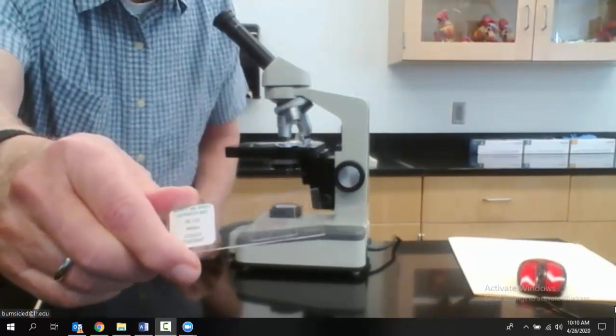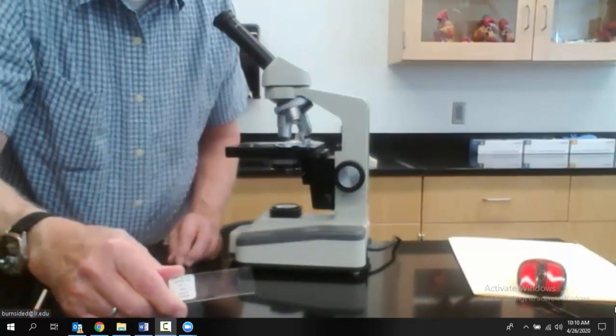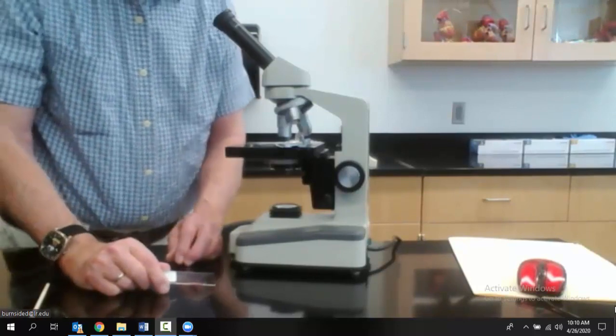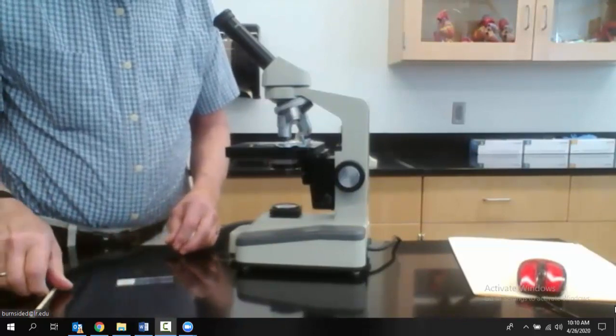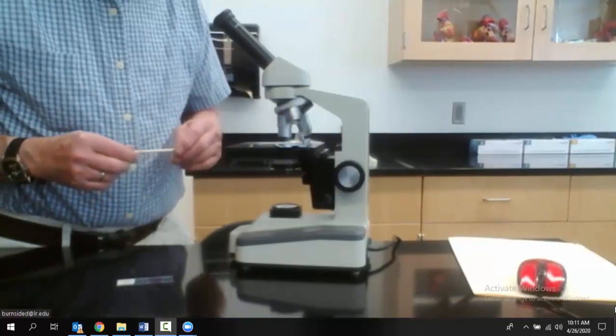This is a section of a cerebral cortex, which is the outer layer of the cerebrum of the brain. Let's look at the microscope first, and then we will take a look at this tissue.